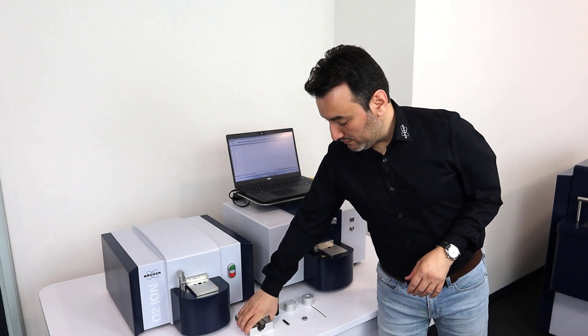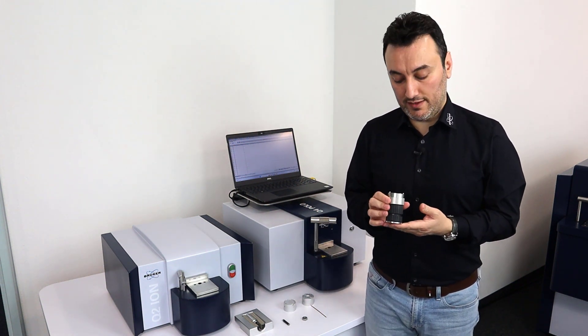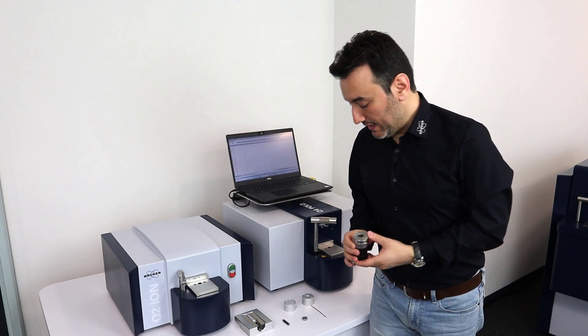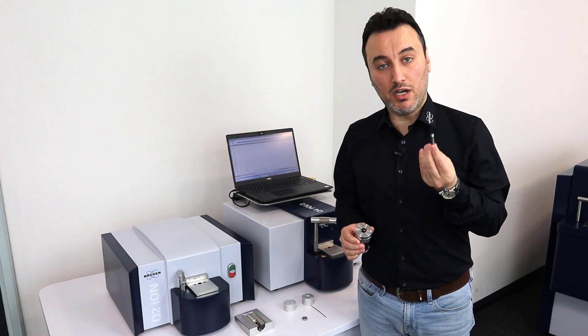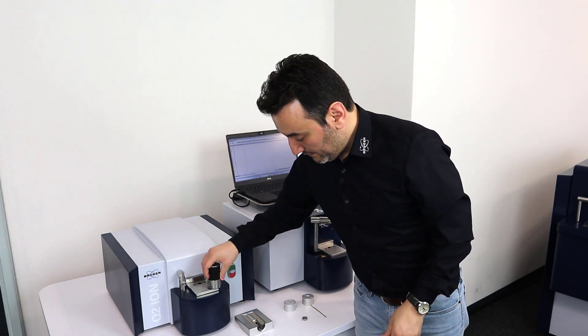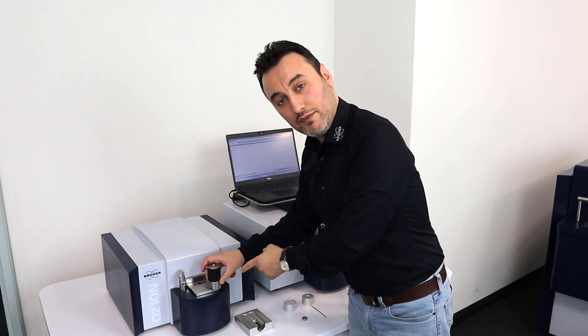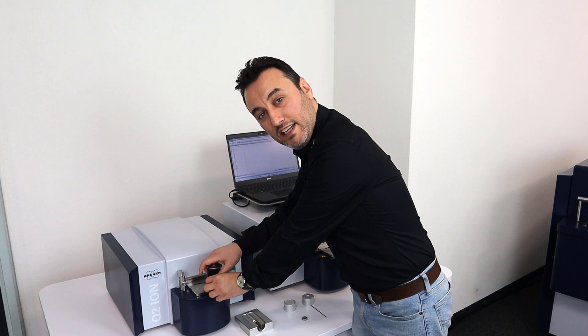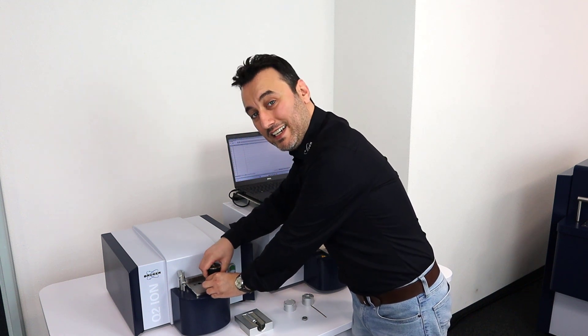The second sample adapter is the wire adapter. With this adapter we can analyze wires with 3 to 12 millimeters of diameter. What I have to do is take my wire sample, place it in here, flip it over on the corner of the spark stand plate, and turn the dial counterclockwise until I hear a click sound.